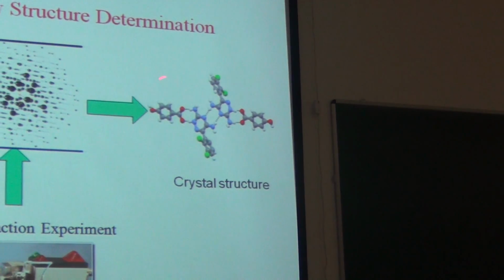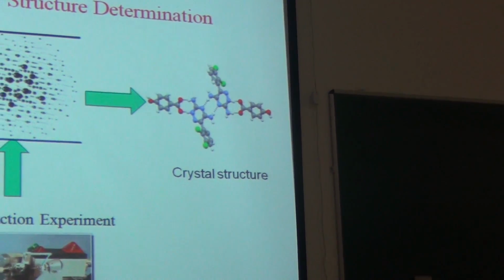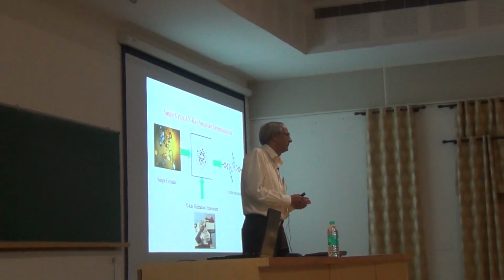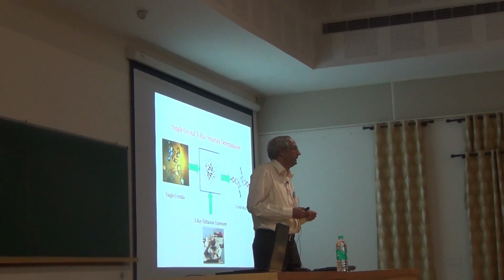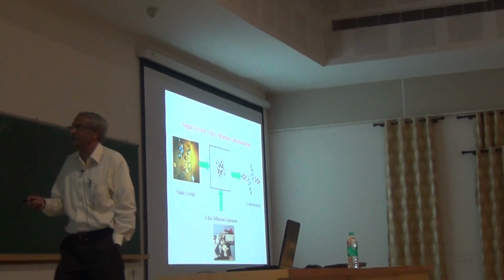In fact, we can analyze the intermolecular interactions that are associated with it, and we can therefore look at what is important in terms of energy, what is the interaction which gives the least energy, what is the interaction which gives the maximum energy, and so on. And as a result, effectively, we can evaluate the energies that are associated with these.